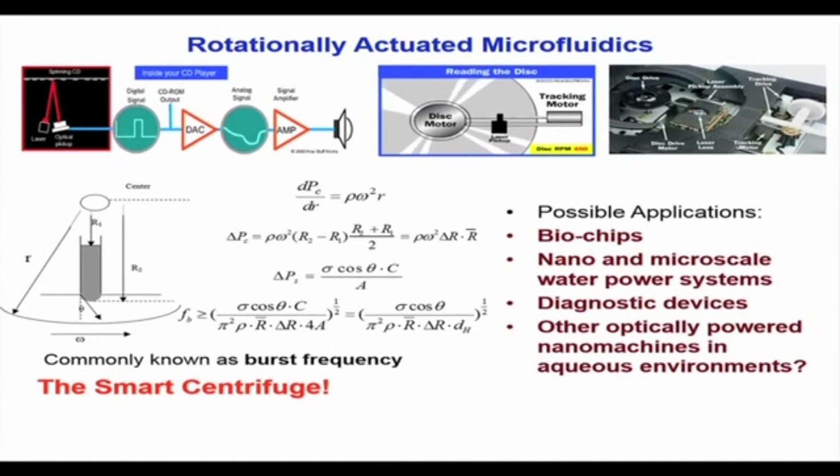And many of the applications in microfluidics where you can have a CD, the challenge that it gives is one, a technological challenge, but the other is also a scientific challenge: the science of fluid flow over such a rotational platform, where microscale forces in addition to inertial force effects may be important. It is a very rare combination that you get.